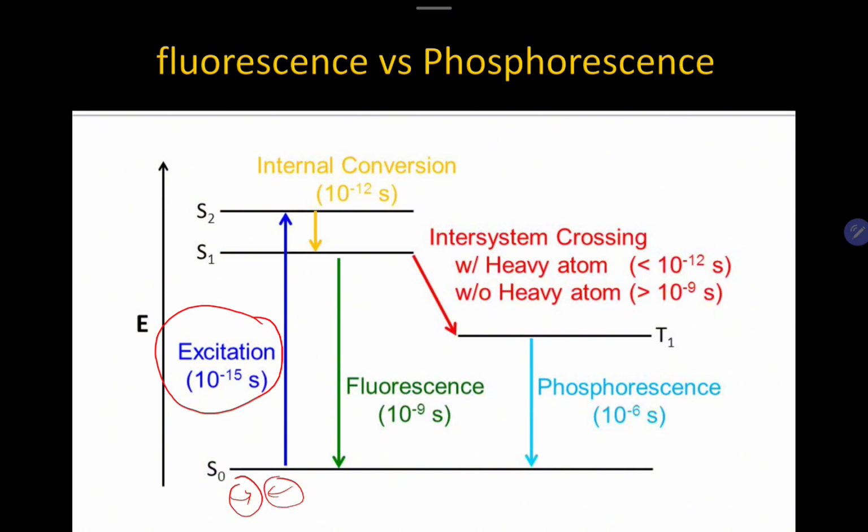Once your atoms are excited by a beam of light that hits them, they have energy, like in my explanation of flame emission. They will tend to be excited, going either to the first electronic state, the singlet state, or the second state. After they are excited, remember, when do they release or lose energy? When the excitation stops. Right.